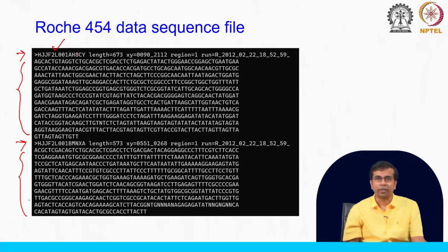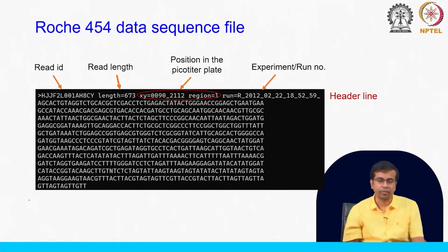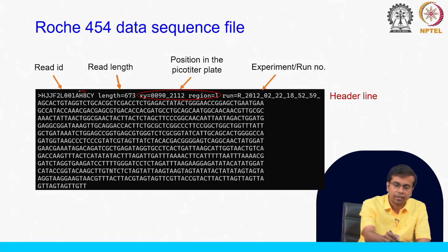Now, what about these other fields that you have there? These are the fields that we see. As I said, the sequence ID actually refers to the read ID, right.